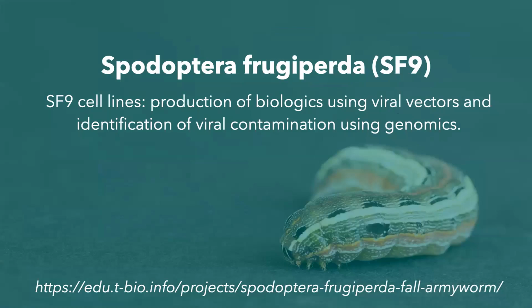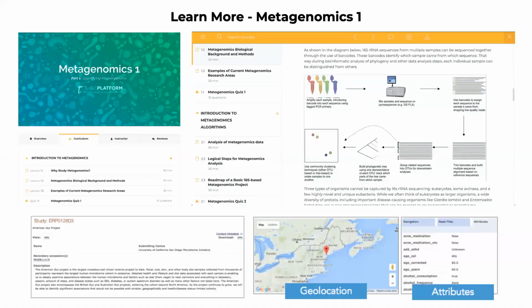Okay, another example that you will find in Metagenomics 1 is how to apply this mapping on a database to identify taxonomy between different types of samples using metagenomic sequencing. And this is going to be relevant for our session tomorrow.